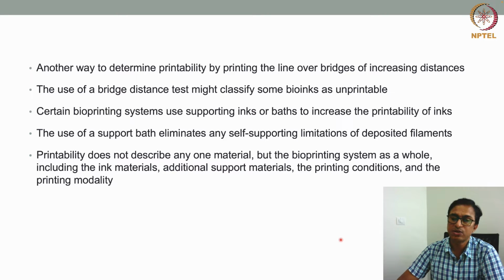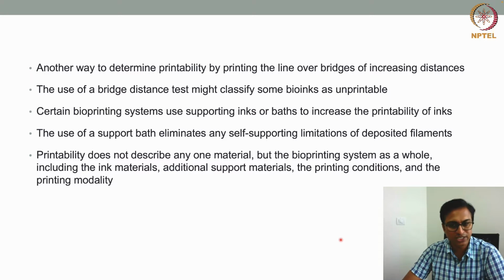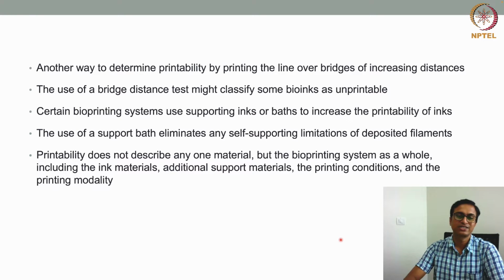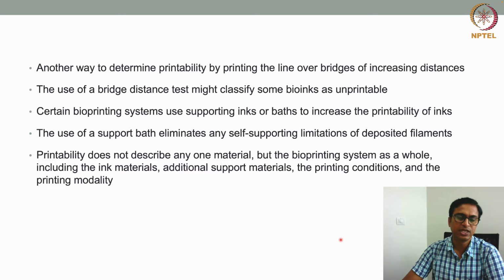So when we are talking about printability, we need to consider all the things together: the bioink, bioprinting system, support bath material, printing conditions, and the modality. When we consider all these things together, then only we can actually classify some materials as printable or non-printable. So this is how the printability of a material can be decided.